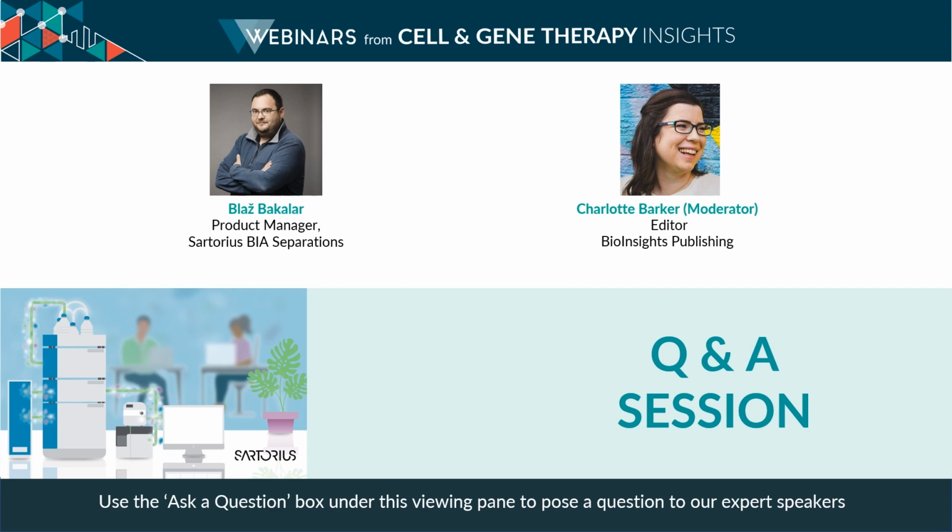Brilliant, thank you. Next question here. You introduced the PrimaS column for analytic use, and the separation results in your example looked very sharp, NTPs, capping, and mRNA, etc. Is this multimodal chromatography resin also usable for large-scale purification of mRNAs? Oh, that's a very good question. Yes, we actually offer PrimaS for mRNA purification on a large scale as well. And we have quite a few clients using it already in that respect. It's especially useful, for instance, if you don't have a poly-A tail in your RNA.